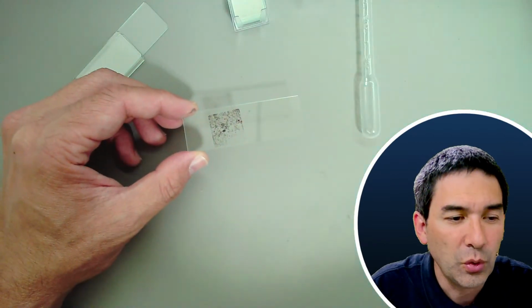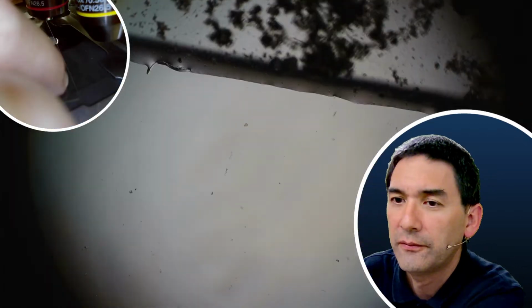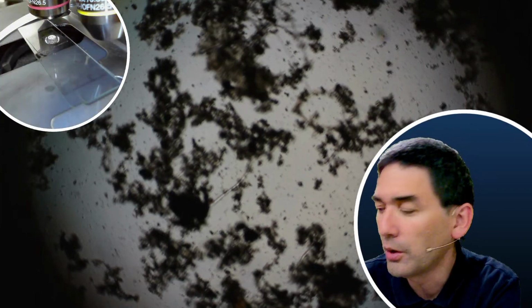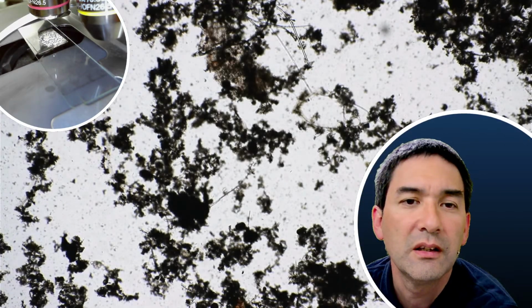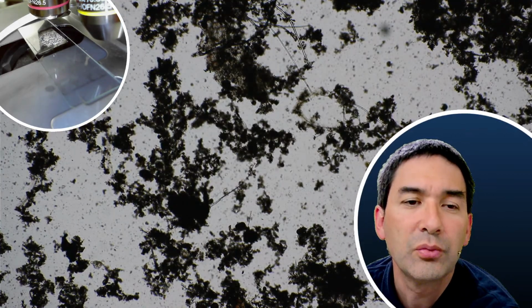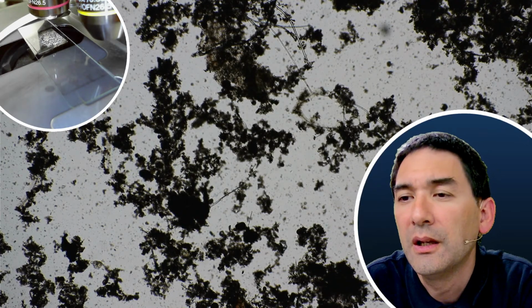Let's go over to the microscope view again. You have to turn up the lamp a little bit. You can see in the corner that I'm now using the 4x objective. And here we are. I need to focus a little bit here, and I'm going to use bright field first. Maybe as we scan through the slide, we're able to see some structures or some things that are a little bit familiar here.